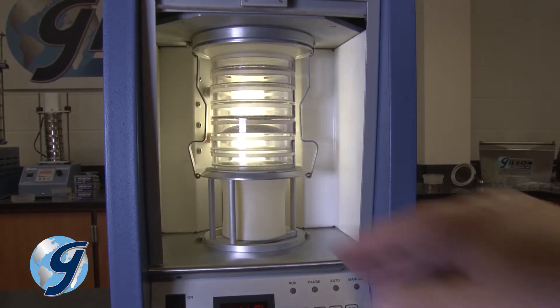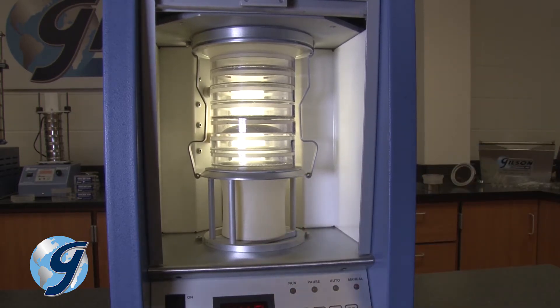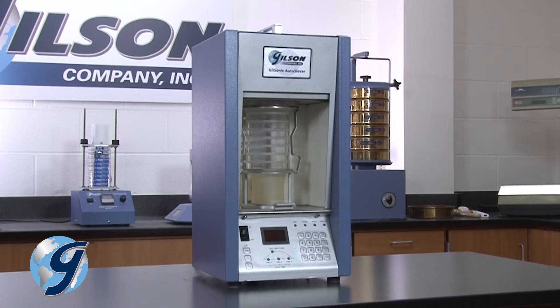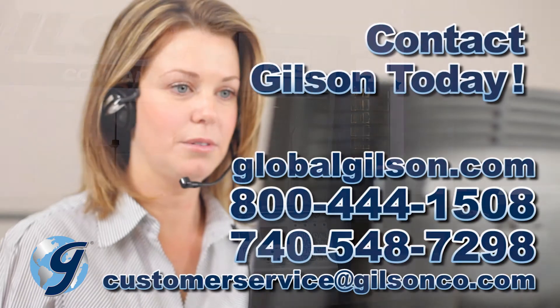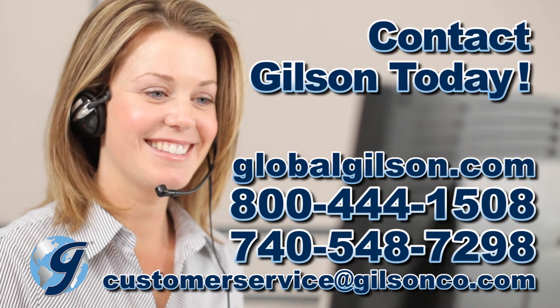Check that the stack assembly is secured by gently pulling the stack outward. The sieve stack for the Gilson GA6 Gilsonic Auto Siever Sonic Sifter is now ready for operation. For any questions concerning the Gilson GA6 Gilsonic Auto Siever Sonic Sifter or any Gilson product, please contact the Gilson Technical Support Team.